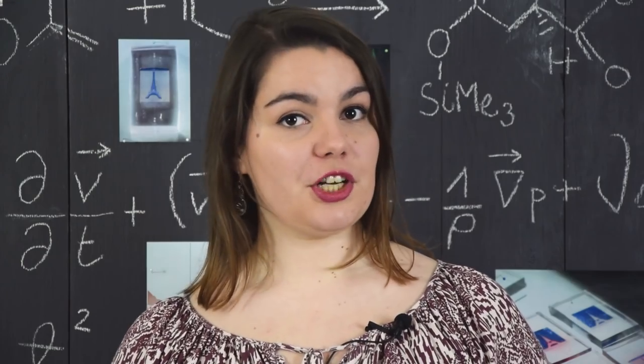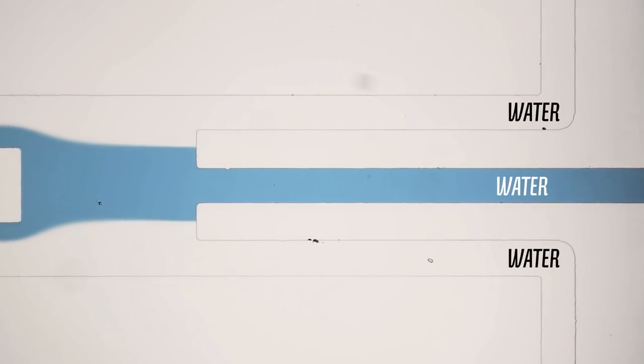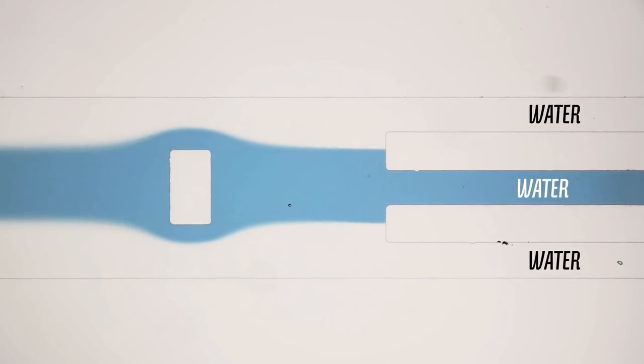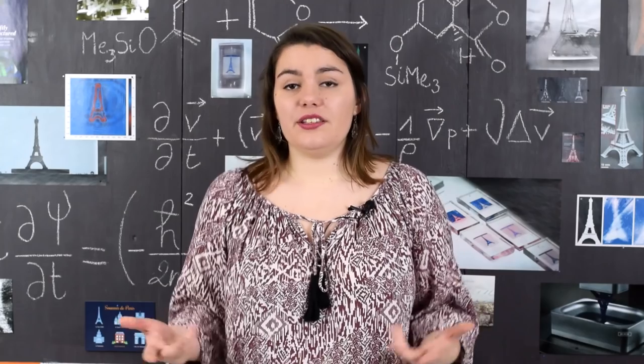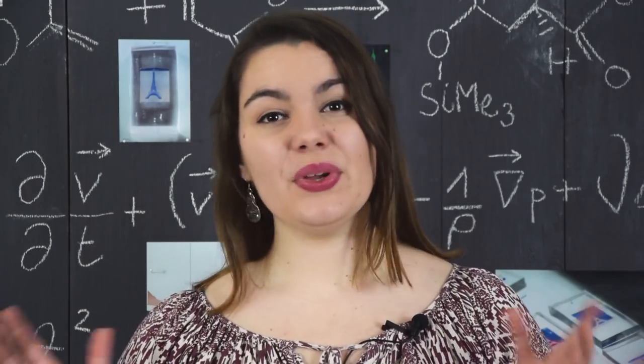But microfluidics isn't limited to droplets. Here's another chip, where this time the liquids won't be separated into droplets. We have three inlets. Water comes through the top and bottom channels, and blue colored water comes through the middle. The channels meet up in a chamber in which an obstacle has been placed. This situation is quite ordinary, it's just water arriving from three different pipes onto an obstacle.